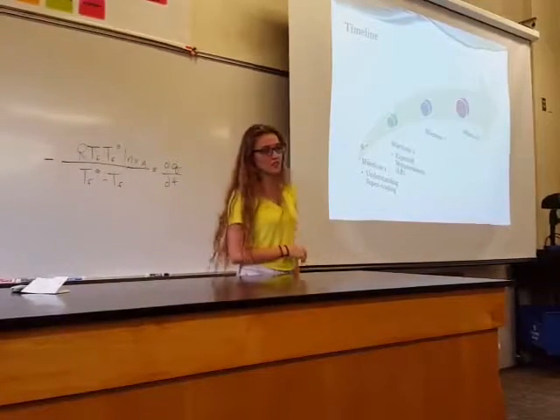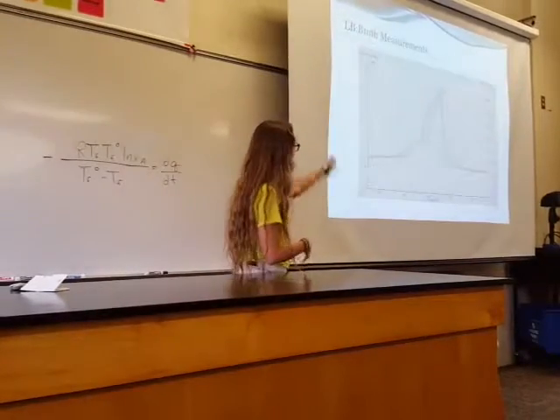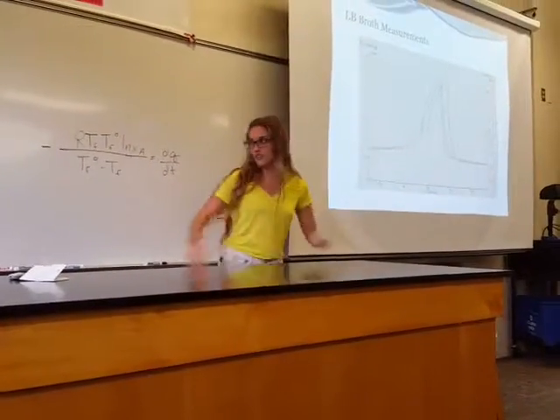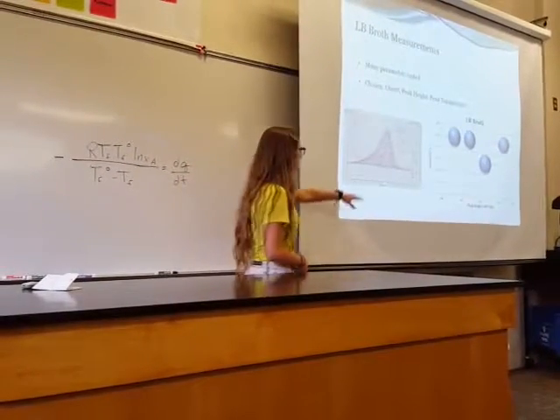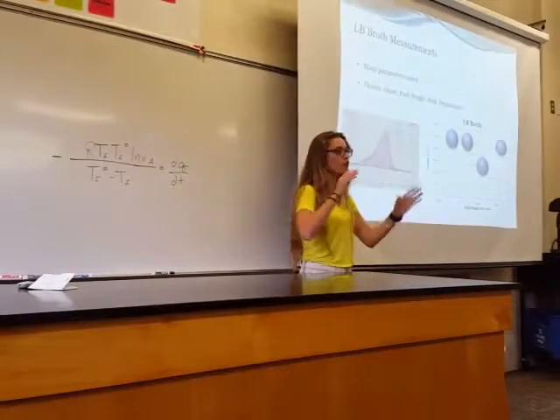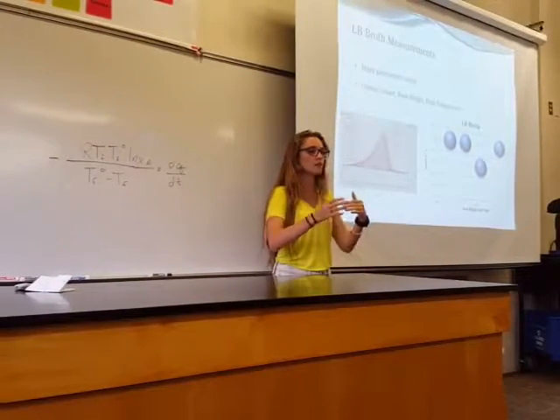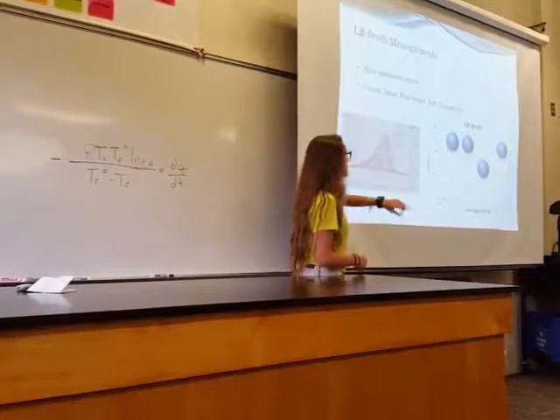And then we wanted to move on to LB because we needed a baseline for our bacteria. And so we did experiments with our bacteria. These were the graphs that we got. And when analyzed, so many different analyses are possible with the differential scanning calorimeter.